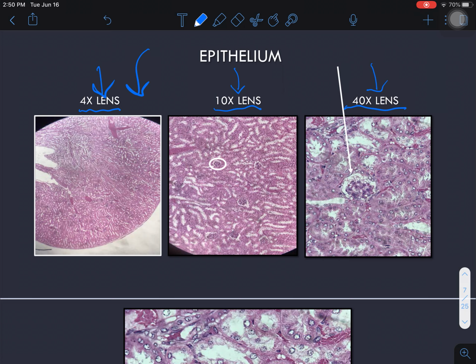When we are looking at the kidney, we're going to separate this, right? We're going to concentrate right here on the outside called the renal cortex. As we get in closer, what we are actually going to concentrate on are these little brain-looking dudes. You can see them over here too on the smaller side, right? You can zoom in on any of these, and what you're going to end up with is this dude right here. This is actually called a glomerulus.